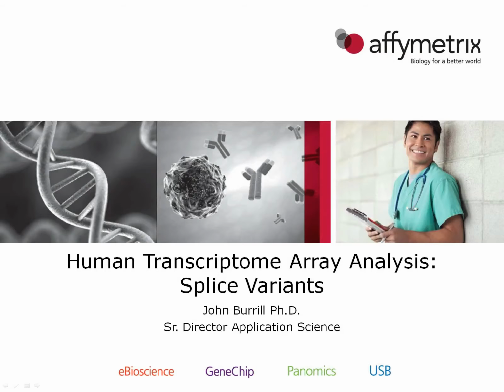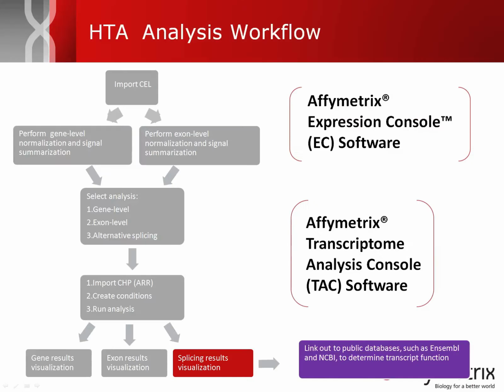Hi, and welcome to today's webinar on how to analyze the human transcriptome array. Today we'll be concentrating on splice variant analysis.